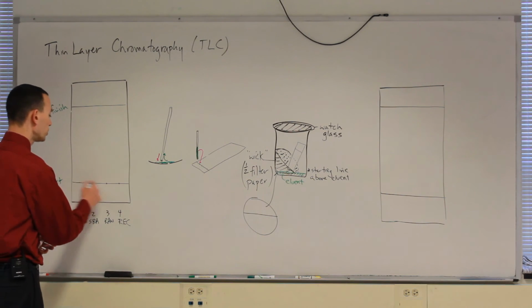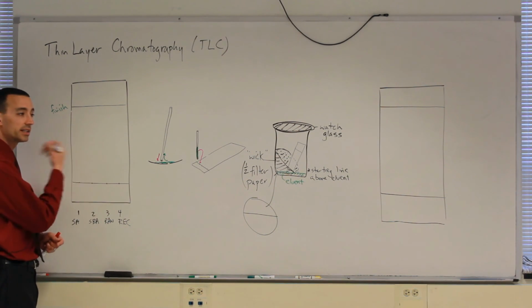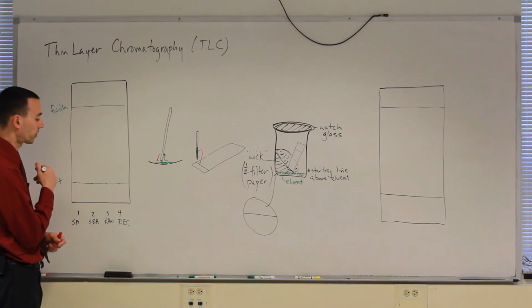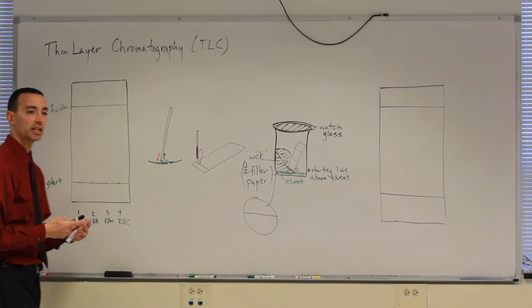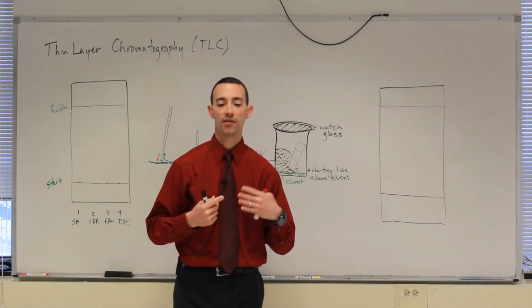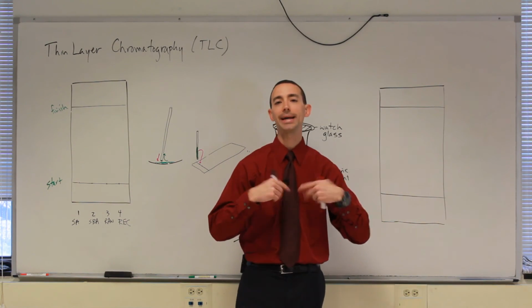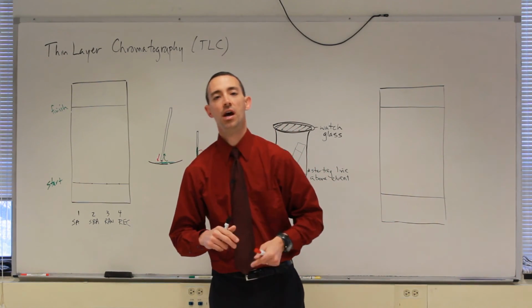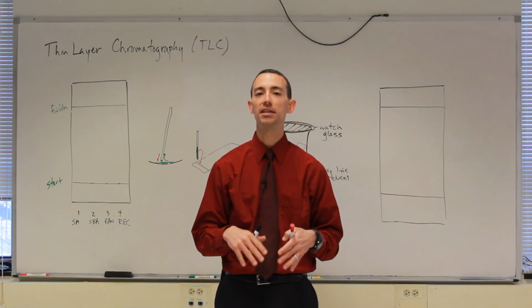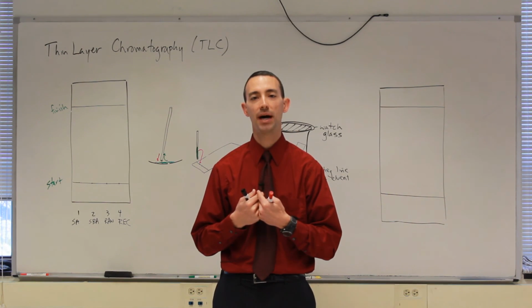When we put those on the plate, and I'll describe that next, and we run the TLC plate with solvent or eluent, what happens is it's like a wave coming in from the ocean. If you've ever been on the shore and had waves come in, you feel them pushing you back in towards the beach. But if you really dig your feet into the sand, you can perhaps resist those waves as they come by you.